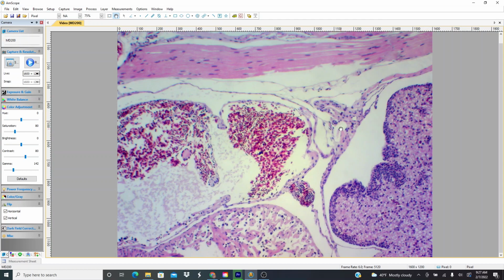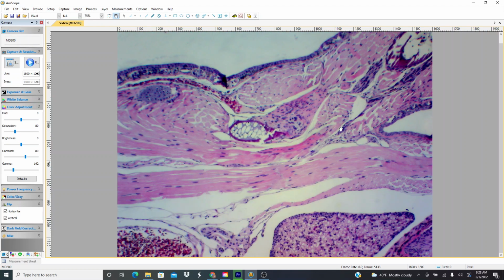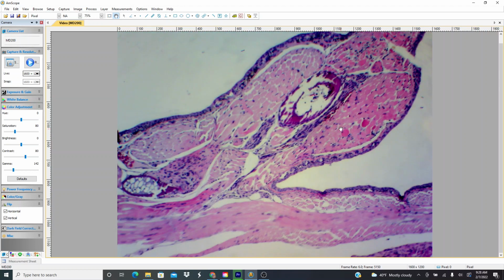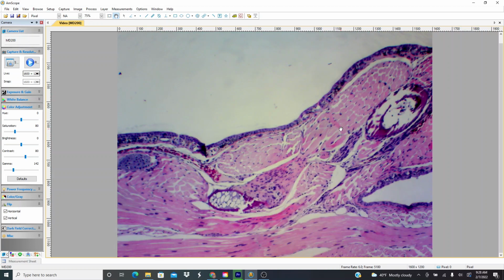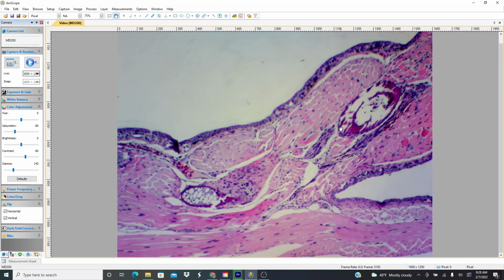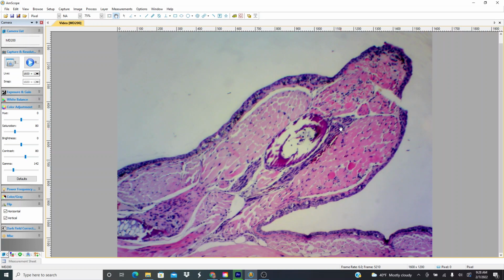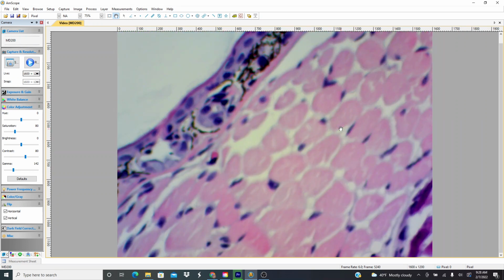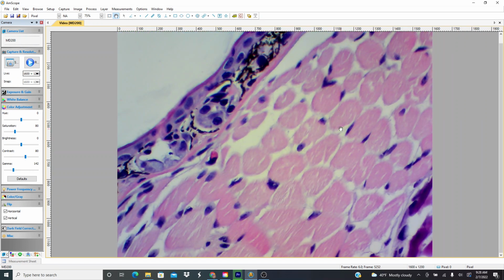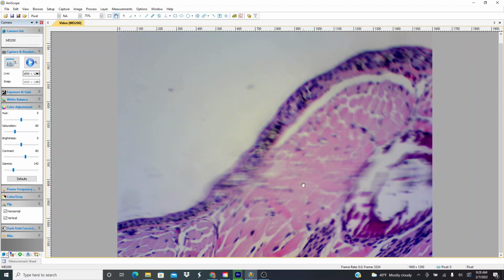Let's go on a lower power now. Kind of heading this way. This is one of the arms. It kind of came off the side. And I think if you go down real high power on this stuff, you can see this is skeletal muscle. Muscle cells have the nucleus pushed to the side of the cell. Not seeing any good cross banding. It's not a good angle. It's more cut on the blunt.